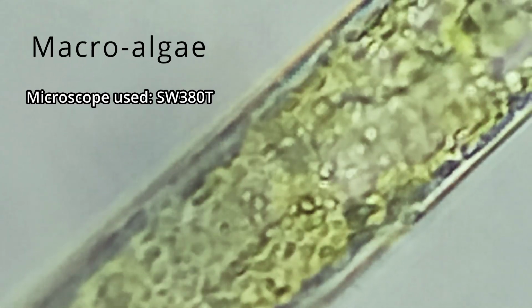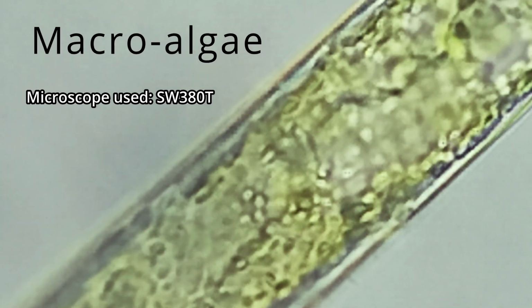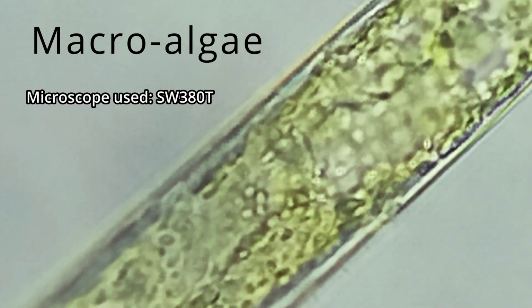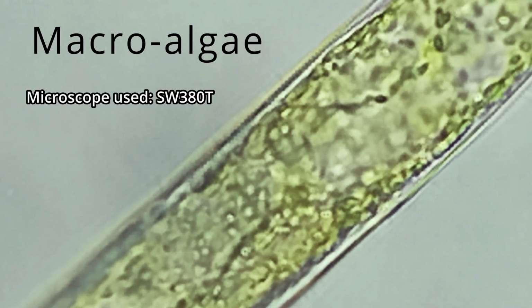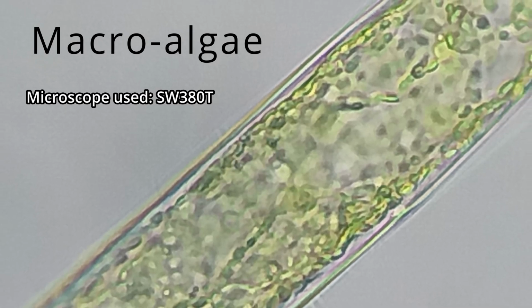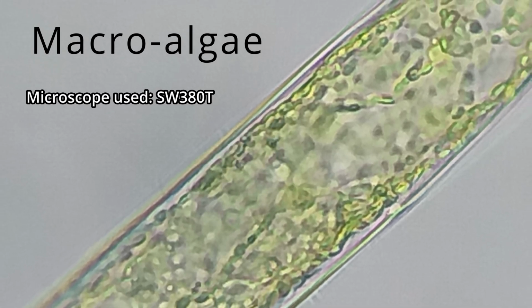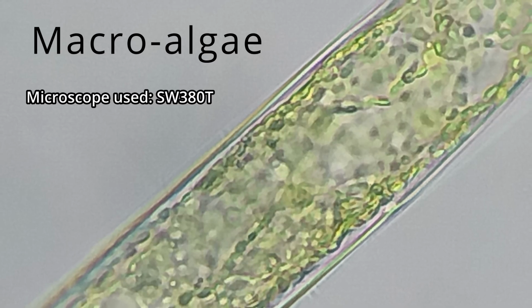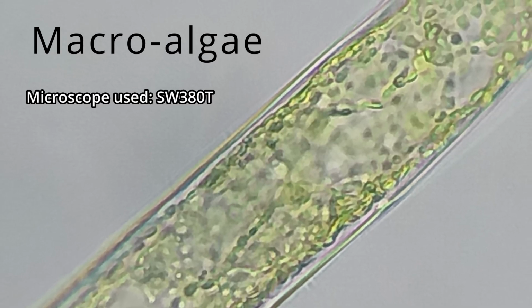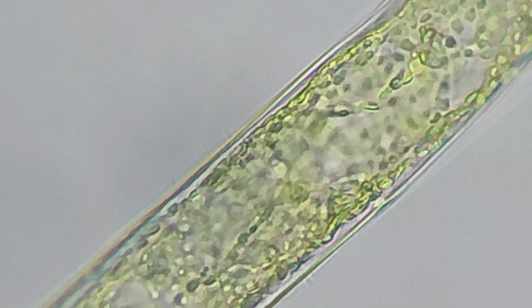Back to the macroalgae. When observing it using the Swift 380T biological microscope under high magnification, we can easily see the chloroplasts, which are the green spheres seen here. They are used to perform photosynthesis, meaning that these chloroplasts are used by the macroalgae to absorb carbon dioxide and water to produce sugars, releasing oxygen in the process.